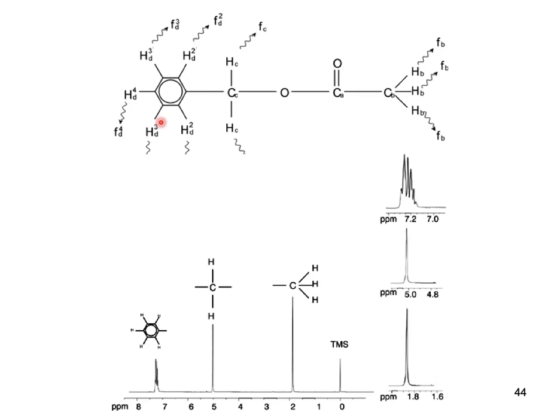Now the second thing is why these signals are at different ppm, different frequency. It depends upon the diamagnetic shielding, right? So you can see this methyl is attached with the carbonyl, right? But this CH2 is attached with the aromatic or benzene ring, right? And then it's attached with the oxygen, right?